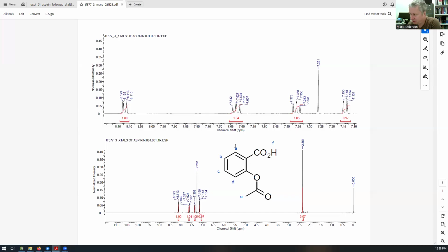This has how many neighbors? It has 1 neighbor right there, and 1 plus 1 is 2. This should be a doublet. On the molecule, this should be a doublet, and this should be a doublet, right? Doublet. And these should be triplets, right? Triplet and triplet. Now, that said, the actual mapping, we do see 2 doublets and 2 triplets, right? A doublet, a triplet, and a triplet.